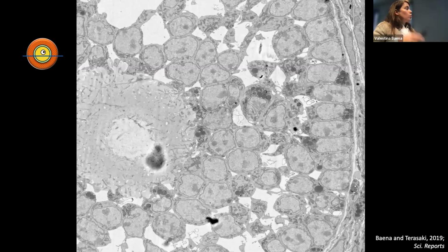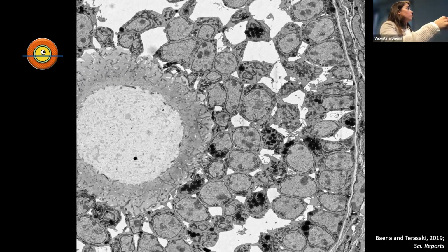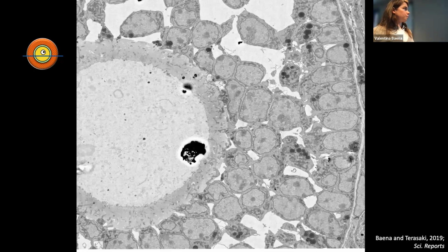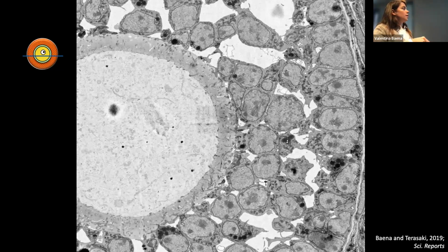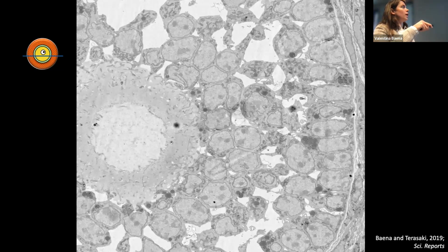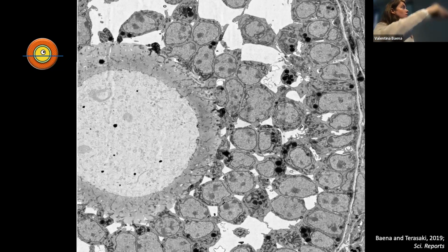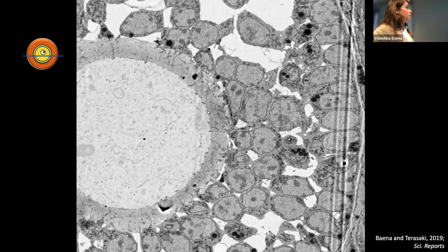And again, this is a low resolution, low magnification imaging run, which is why you see all of those artifacts. Typically, with your high resolution data, it is unlikely that you will find so many artifacts. But I like showing this video because it highlights the volume size. In this case, the oocyte is about 80 microns in diameter. So this is a pretty large field of view, and this is just a crop from the entire imaging run.